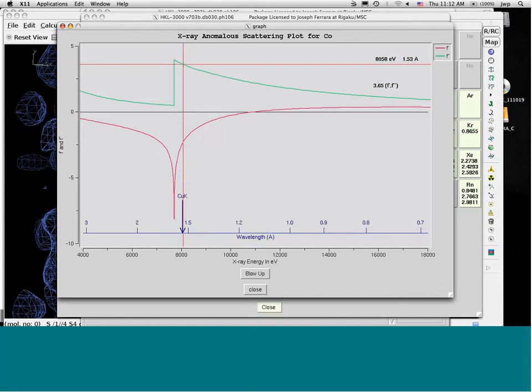So you have to ask yourself why your crystal was slipping, and fix that. Certainly HKL does a good job of tracking the slippage of the crystal, and so does d*TREK and the other packages. But it's just one more thing that goes into it. It adds systematic error to your data, and it's probably better to collect good data from the get-go. So it was not only the crystal slippage, Angela. What was the first thing? Severely twinned. So I'm not sure if that means cracked or really twinned. Yeah.